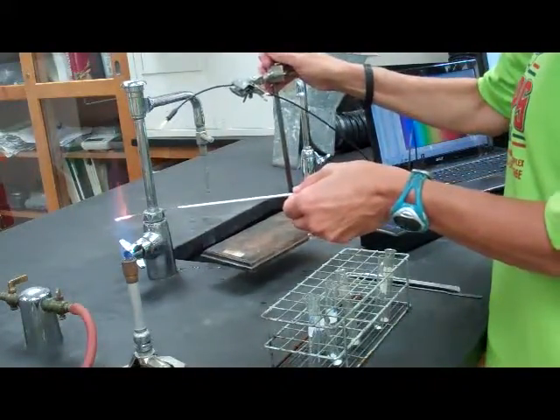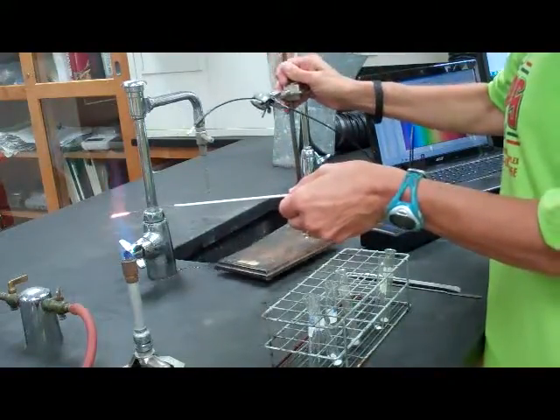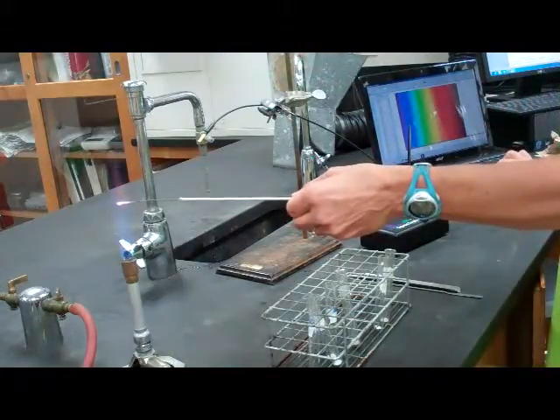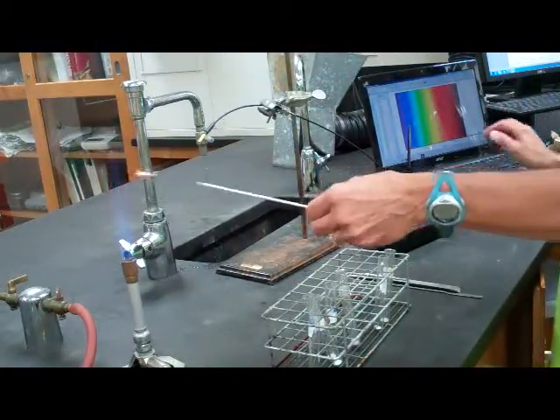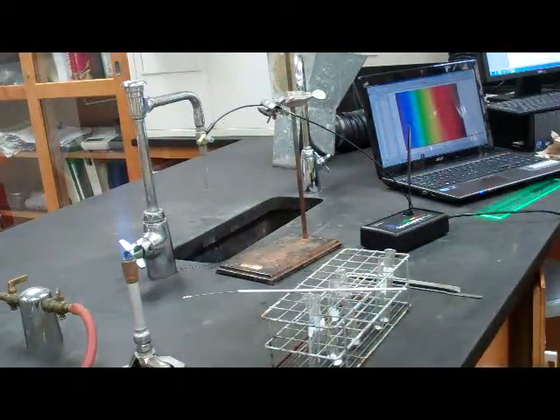Just trying to see, notice that there really is no change in the intensity if I move it closer. In case we're having trouble seeing those colors, I thought I'd turn the lights down a bit here.